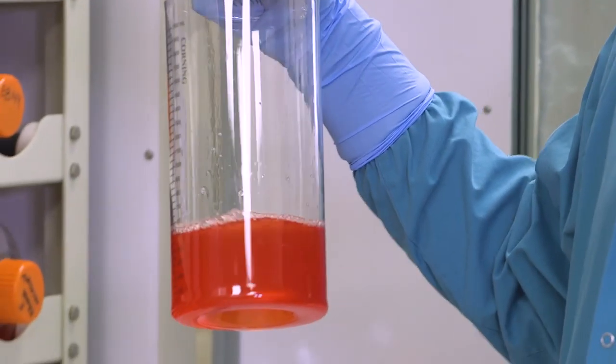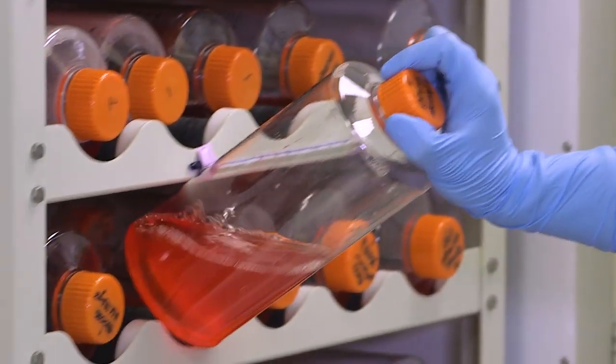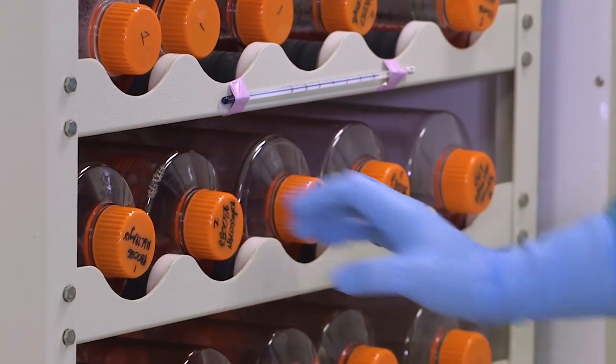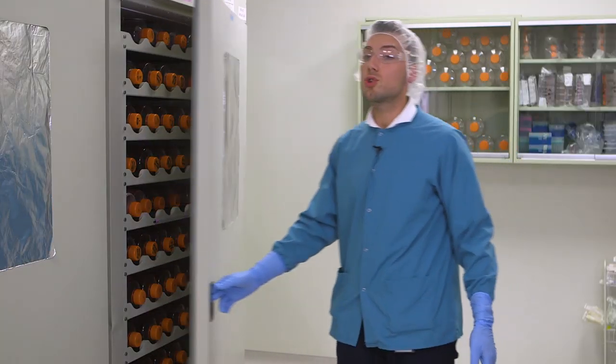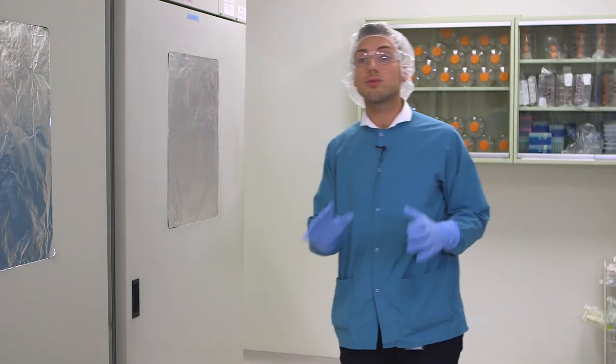The roller bottle process typically takes around six to eight weeks from initial cell line thaw all the way through culture supernatant harvest into concentration.